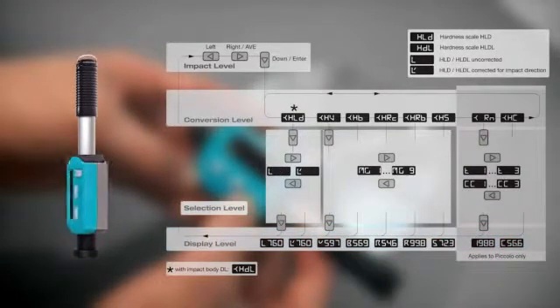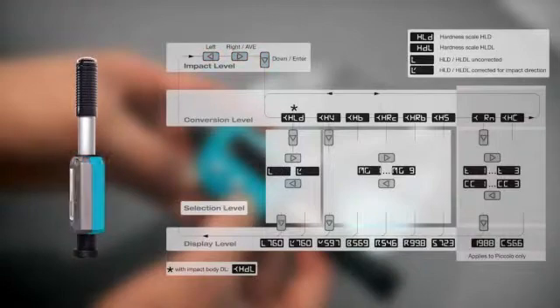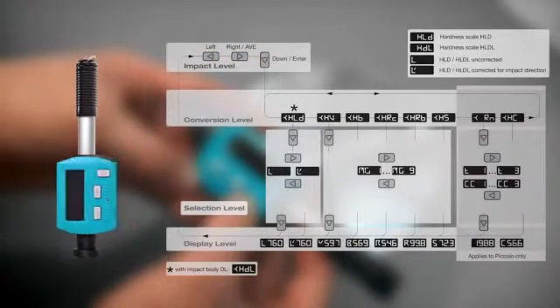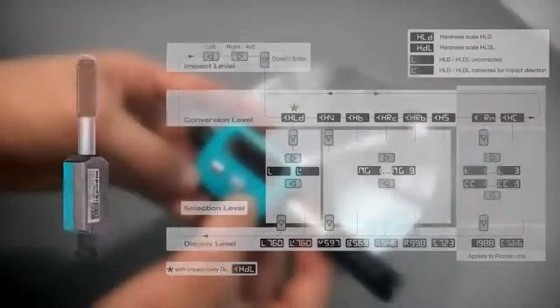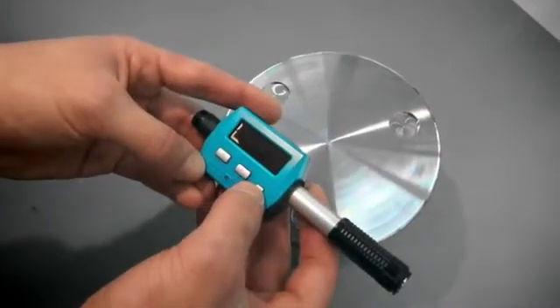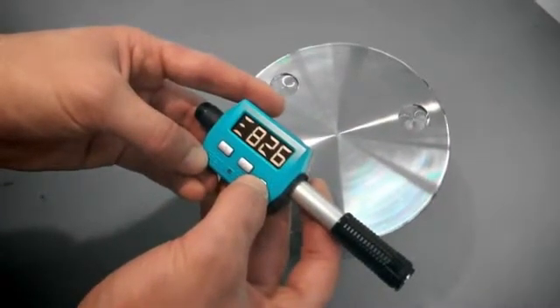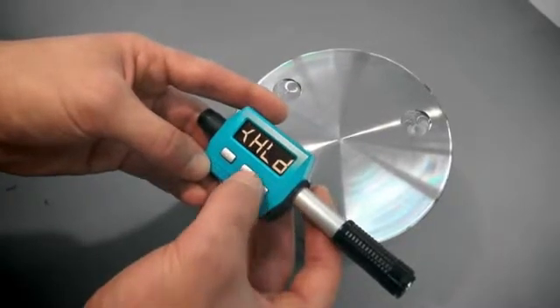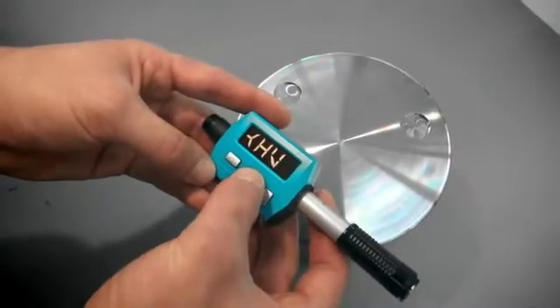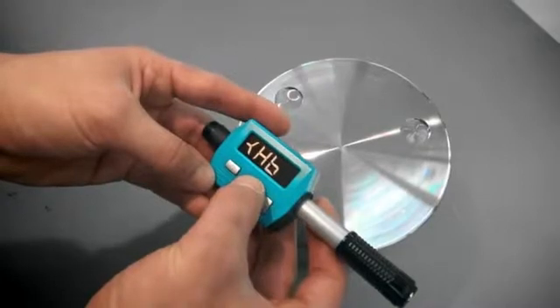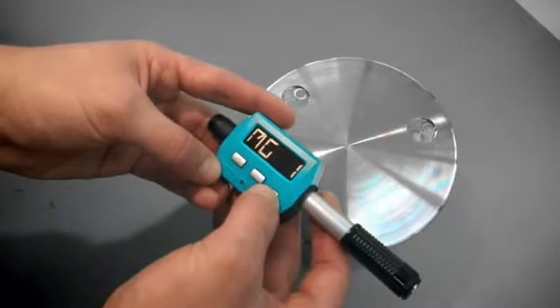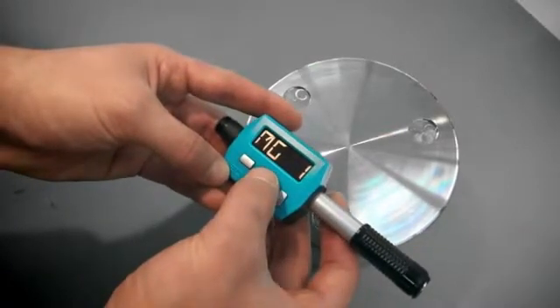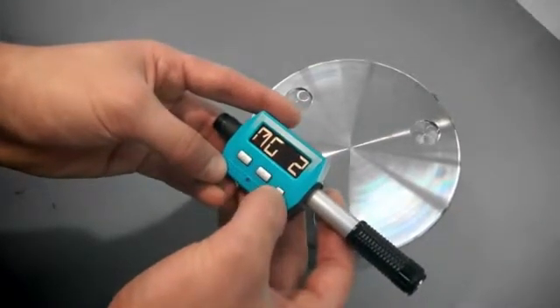If you need results in other hardness scales such as Vickers, Brinell, Rockwell, or Shore, the EchoTip Piccolo can perform the required conversions. Enter the conversion scale menu level by pressing the down key. If you press the right key, the instrument displays the different hardness scales. Select the required hardness scale by pressing the down key again. Select the appropriate material group by pressing the right or left key and confirm with the down key.